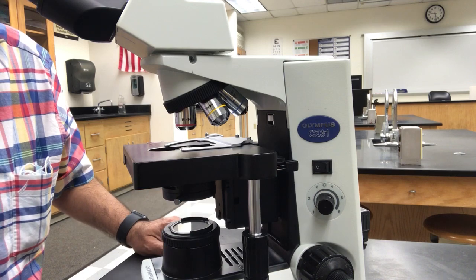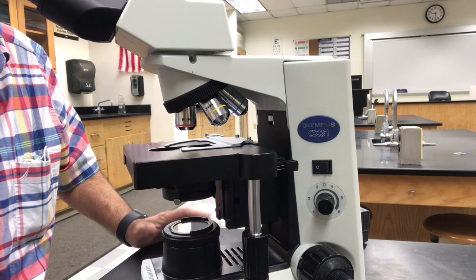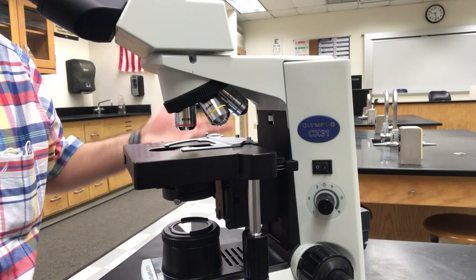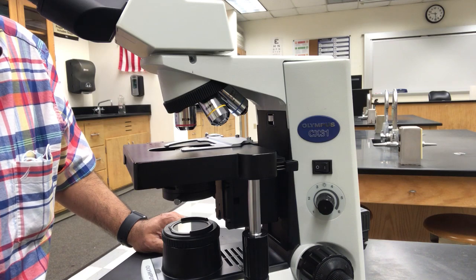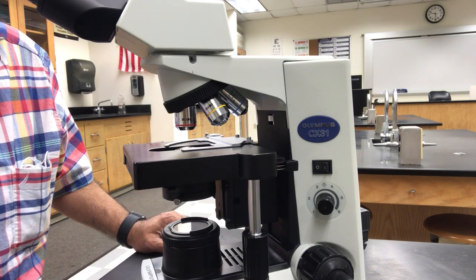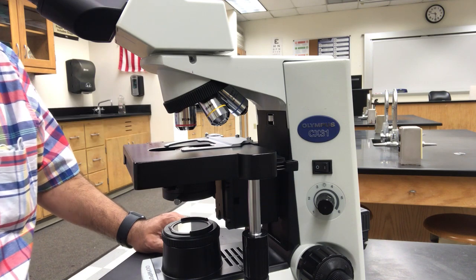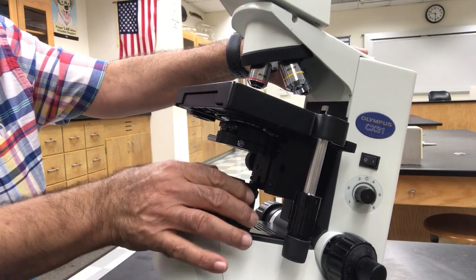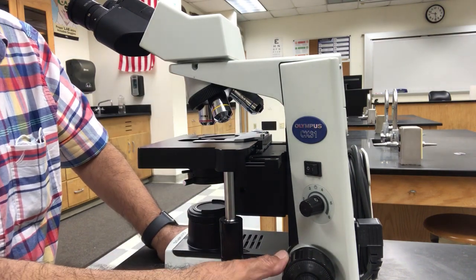If you would have done it here in the lab, you would see how if you have the iris diaphragm open and allow too much light to come in, a white transparent object like a cell would actually be invisible. You wouldn't be able to see it until and unless you close the iris diaphragm completely and create a contrast so you could see the object. I already mentioned the substage light here, and then you have the two big and small knobs.